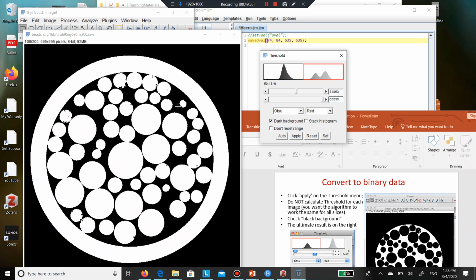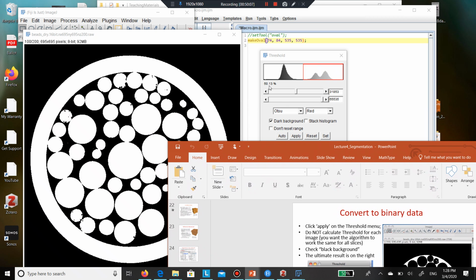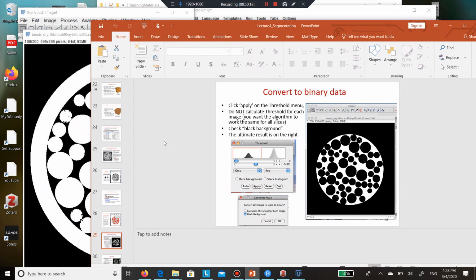So I can now apply the oval. The order of these operations depends on the image you have. That's why I'm staying around here and discussing, because these choices ultimately matter. The choice you make identifies background in a certain way and the rest in a certain way.